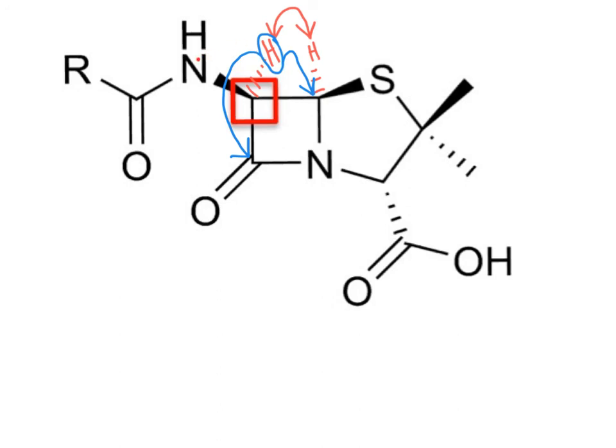We find if we go another step here, we run into a nitrogen. If we go another step this way, we run into a nitrogen. If we go another step this way, we run into a sulfur. And typically those heteroatoms are going to prevent longer range observation of correlations. And so as a result, for this particular proton, we actually have 2 HMBC correlations that we would expect, because going further out, you could think of as being blocked by the presence of these heteroatoms.